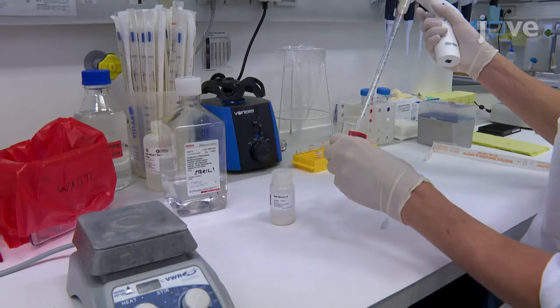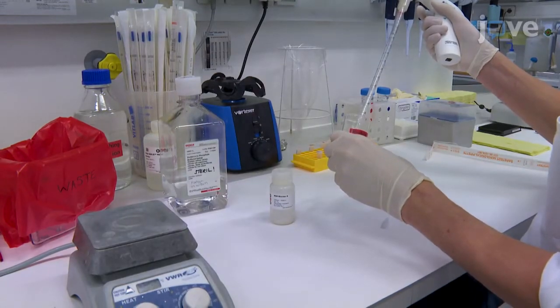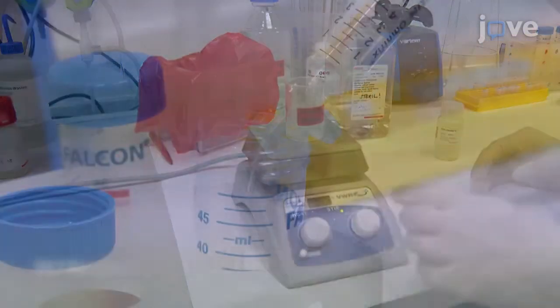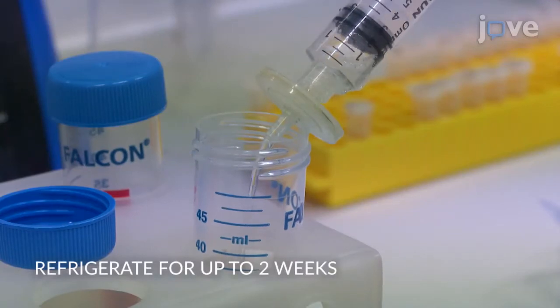Prepare a blocking solution of 3% blocker A in PBS and stir gently. Sterilize the blocking solution by filtration.